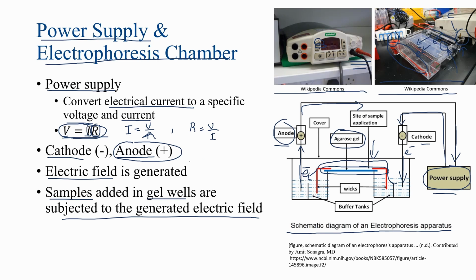Importantly, before I move on, I want to discuss some key points that can help clarify matters, in case there may be some confusion that arises if you look into the current and the electrical field from a physics point of view. In physics, current is by definition the rate at which a charge moves.